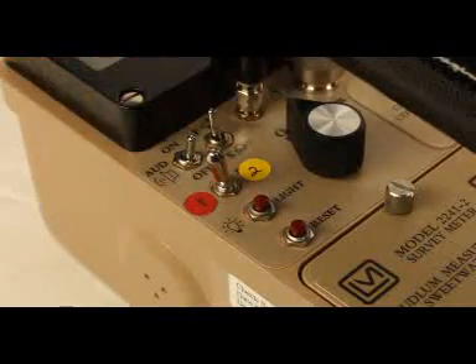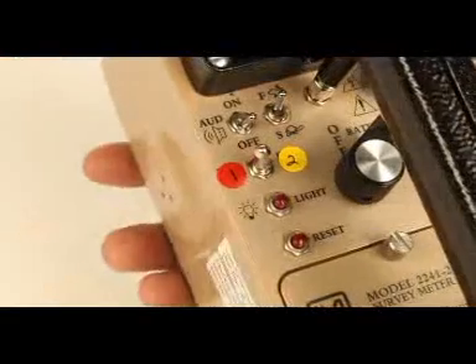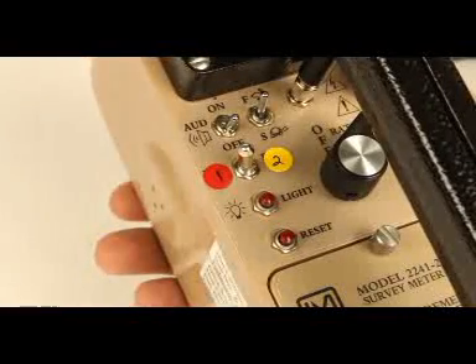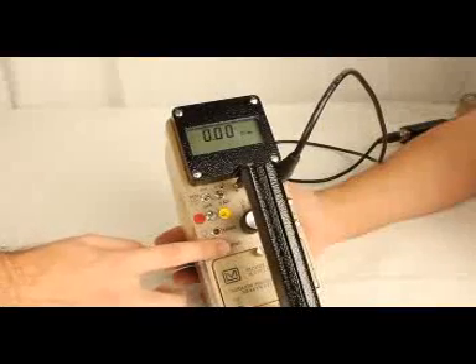To turn on the meter, turn the off-scalar rate meter switch to the rate meter setting. The audio may be silenced or enabled via the front panel toggle switch. Even if the audio switch is in the off position, if the alarm is triggered, an alarm will still sound. An audible alarm can only be silenced by depressing the reset button.